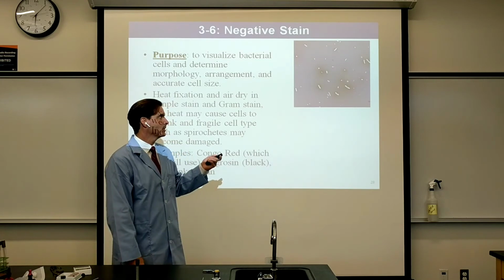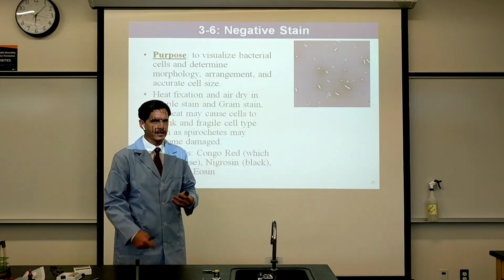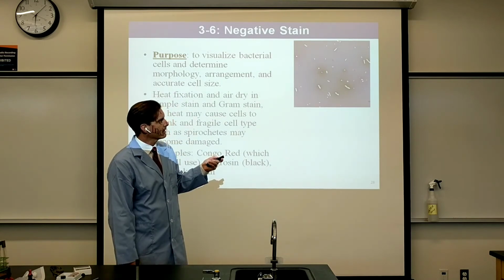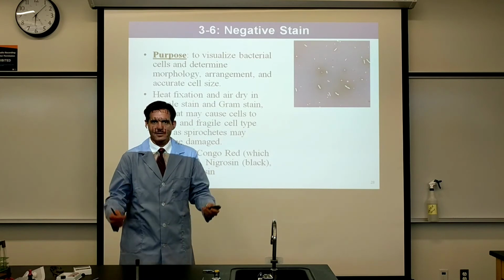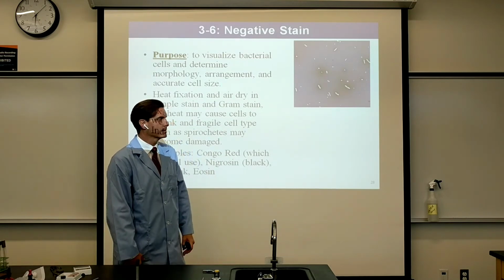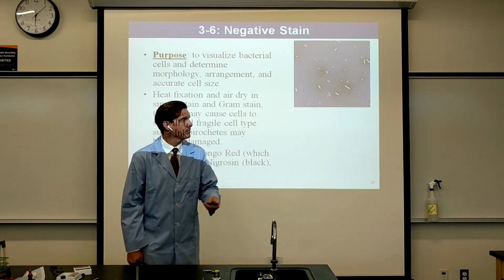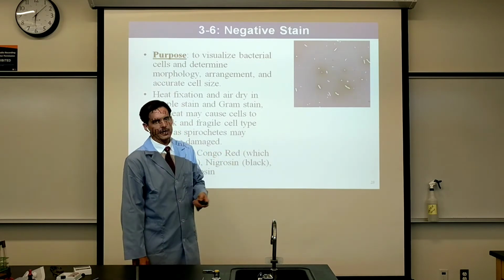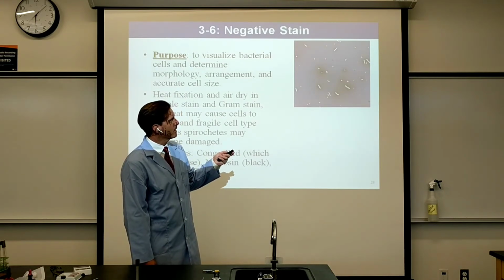Now, not every single little tiny clear object in here is bacteria. Some of these can be oil bubbles or air bubbles or dust, debris, who knows. But the objects that look fairly regular in shape, like these two rod-shaped bacteria connected together. This is a rod-shaped bacterium. These are rods.